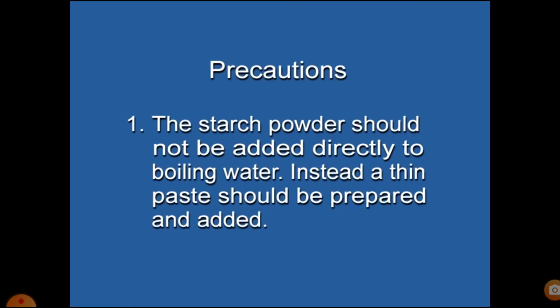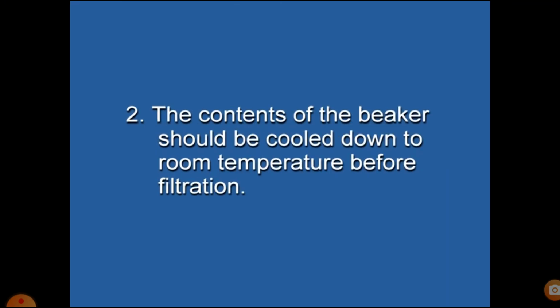Precautions: the starch powder should not be added directly to boiling water. Instead, a thin paste should be prepared and added. The contents of the beaker should be cooled down to room temperature before filtration.